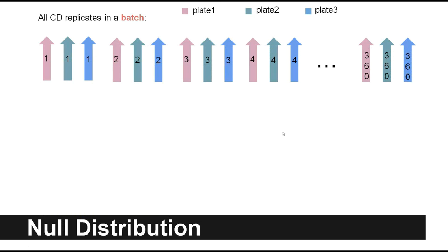By simply using the average cosine distance, we can rank all the experiments from the most significant to the least significant. But we definitely need a cutoff to tell us at which point we define experiments as significantly different from control, and after that point, the experiments will not be significant.